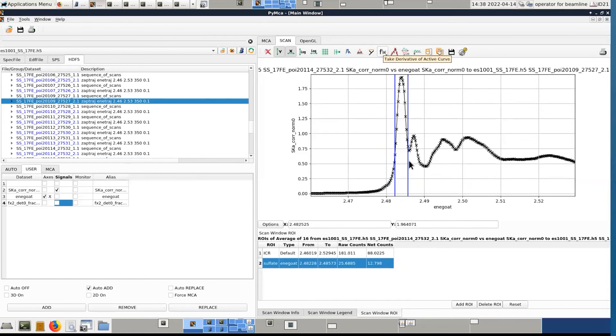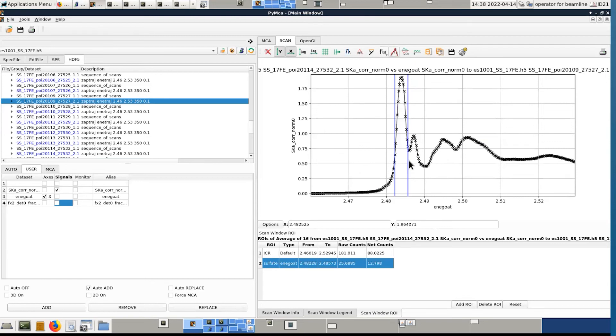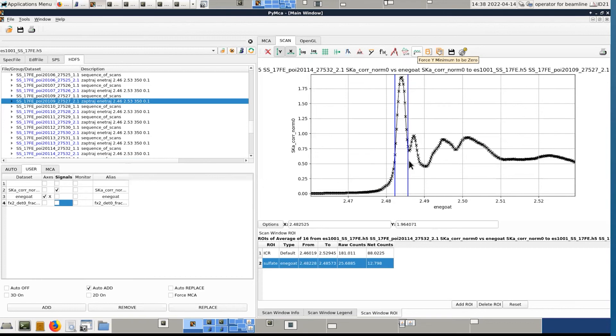Here you have the possibility to calculate the derivative. It can be useful. Sometimes for XANES people are relying on the maximum of the derivative to see some tiny shifts of edges and so on. Here you can smooth if necessary. Here you can invert or multiply the active curve by minus one.